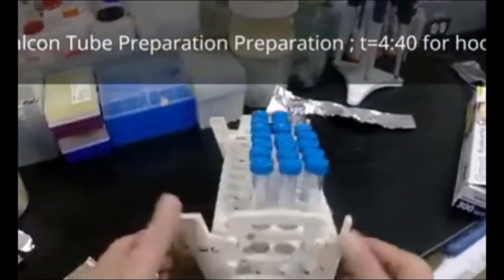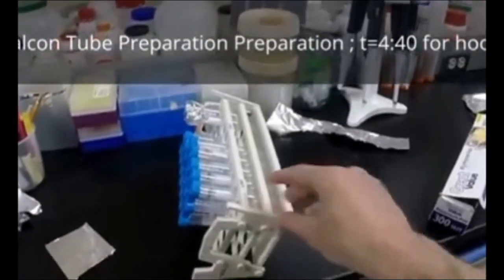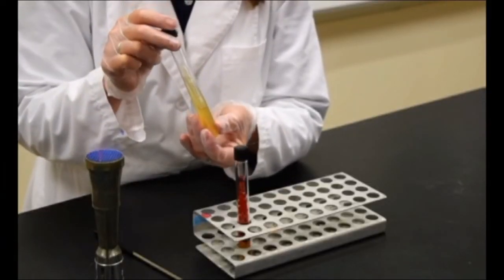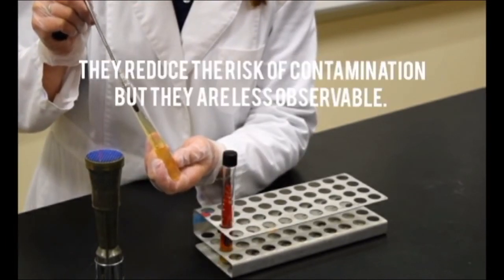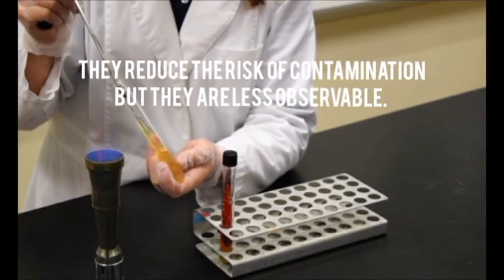It simply is a pop-off or a screw cap tube partly filled with an agar mix and letting the medium solidify at a slant angle. They are used for storing pure cultures for a moderately long term. And their advantages, they reduce the risk of contamination, although they are less observable than those in petri dishes.